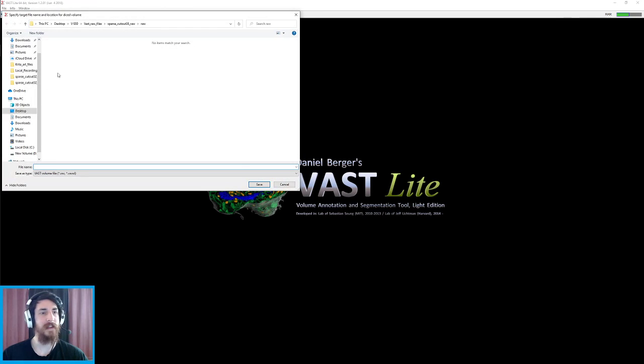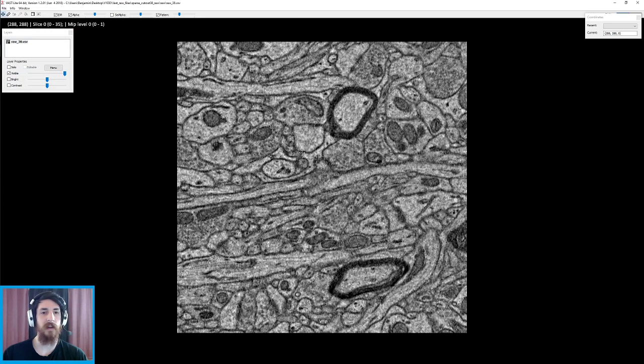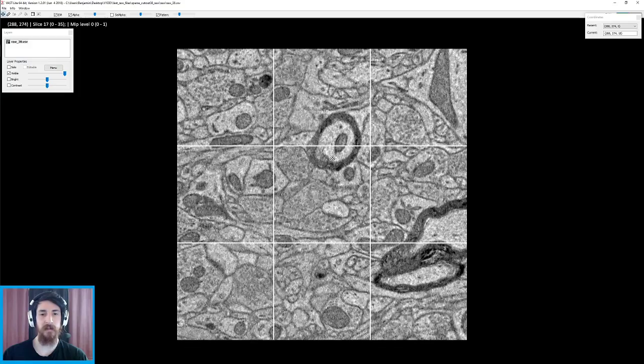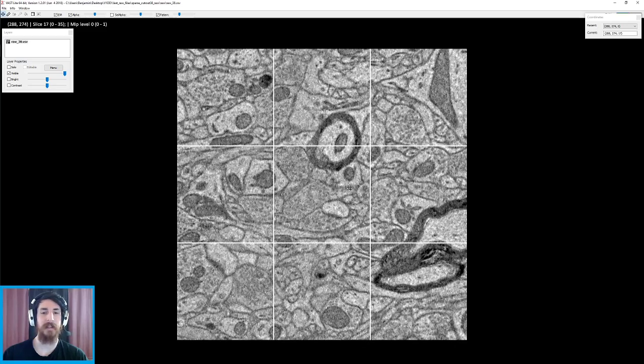We're going to say OK again. It's going to ask us where we want to save this condensed file. Here is fine, so I'll just say raw 38. Save. It's going to open it. Save file. Sure thing. Let's take a look. Alright. Looks like we have a little membrane swirl. We might have to deal with that. We might. We'll see.